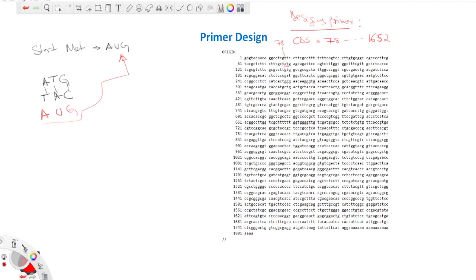I will underline my ATG region here and lock it to emphasize that this is what we are working with. Maybe if I assign it a different color, in green, this is the region that we want to amplify, starting from this ATG, going down to here.